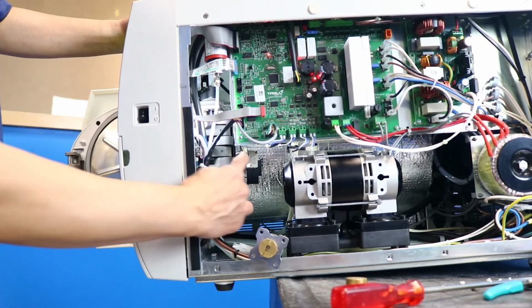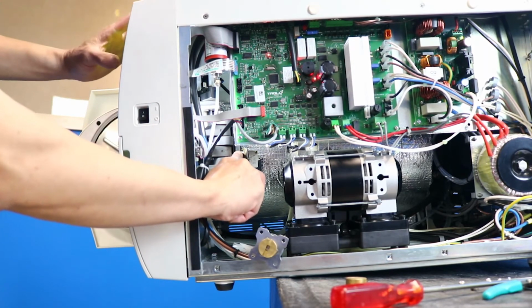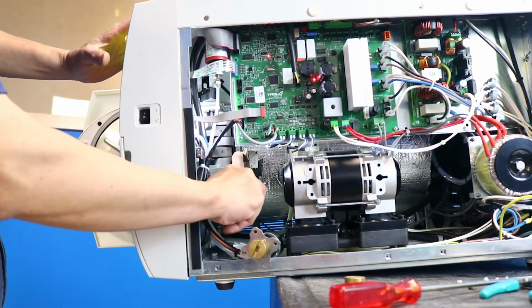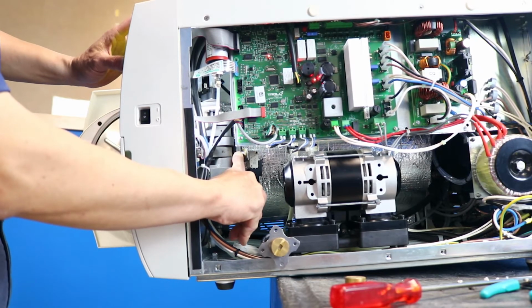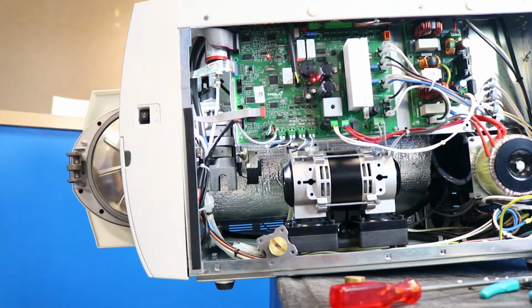Use the door lock menu to control the motor. To turn the motor 1/4 turn, start by holding down the microswitch button inside the unit's right side. Then, on the LCD, press Enter. This will turn the shaft 1/4 turn. Activate the motor in quarter turns to find the right position.